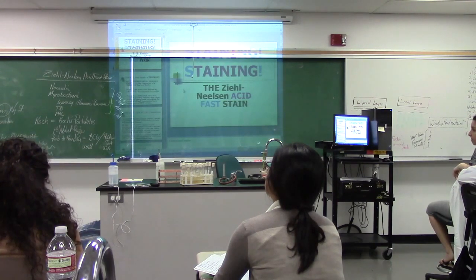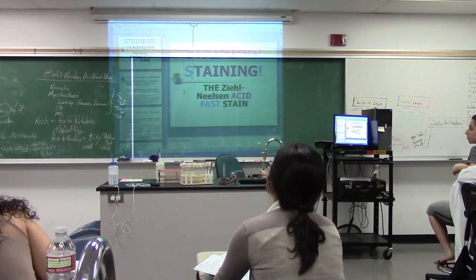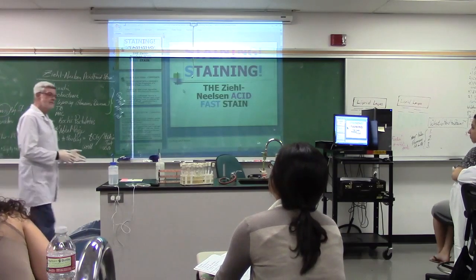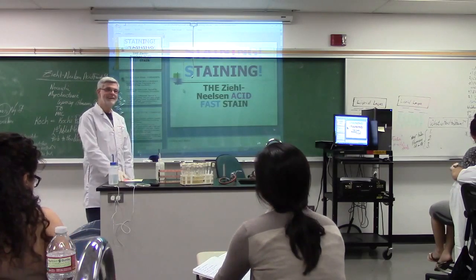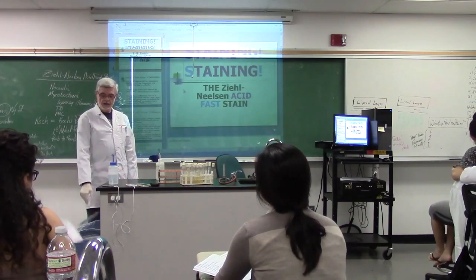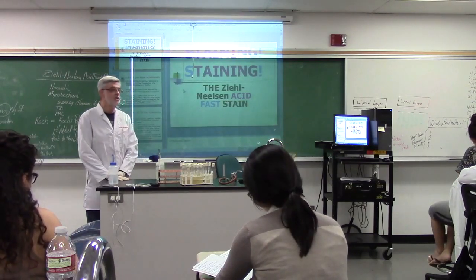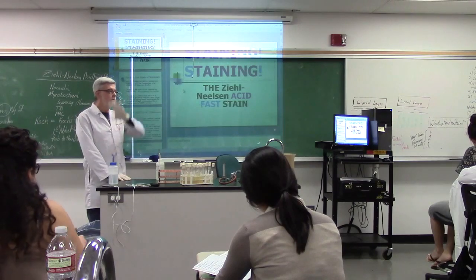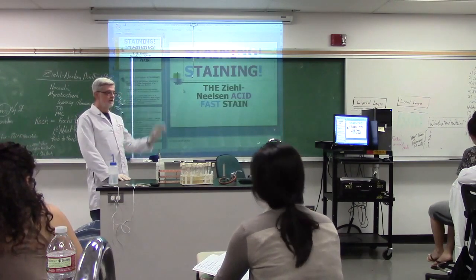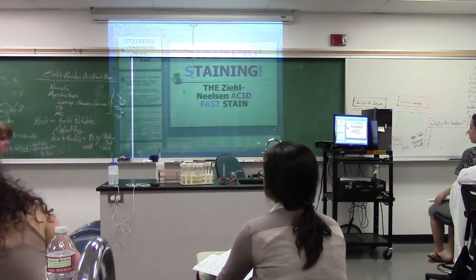And the hint on the endospore stain, remember, if it keeps the first stain, it's positive, and if it keeps the second stain, it's negative. Remember that? Forget it all. On the endospore stain, I want you to forget the color green. The color green should not enter your mind. Green, forget. I don't think of green. Okay? And we'll be talking about that in a little bit.